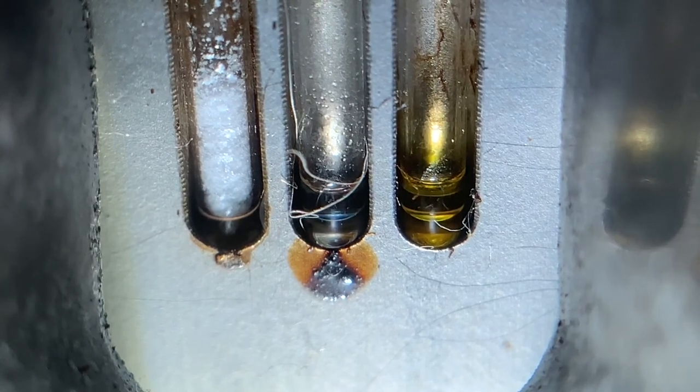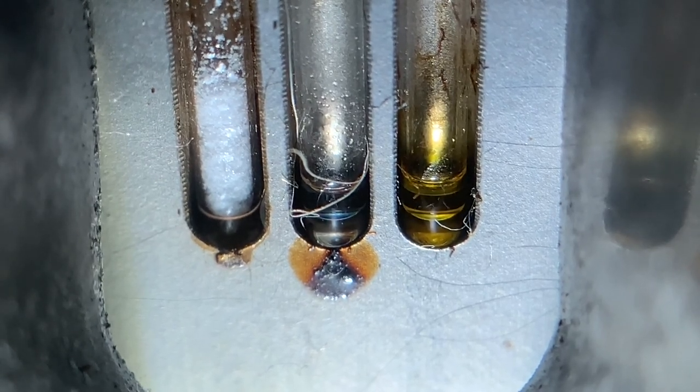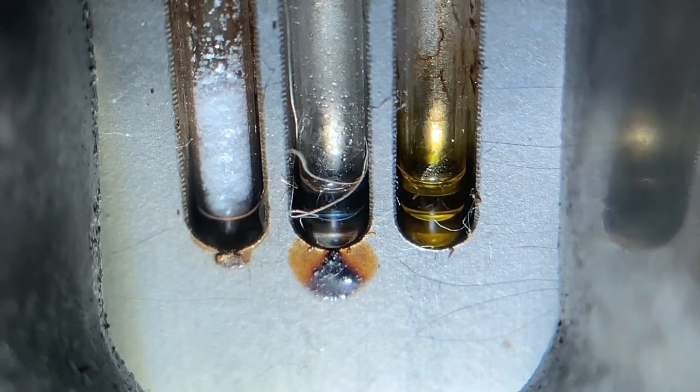98 degrees Celsius. I just double checked the melting point for 9-fluorenone and it claims it really is 83.5, so I think maybe we ought to take a second sample of our 9-fluorenone and double check, because it melted at between 65 and 70.